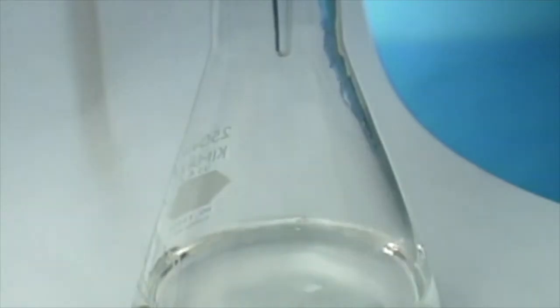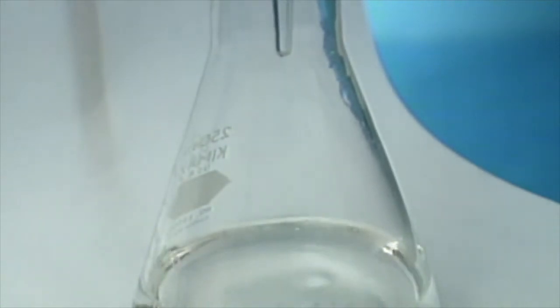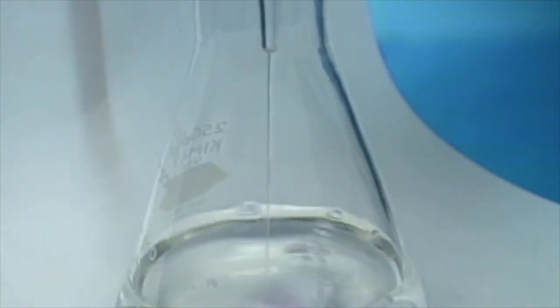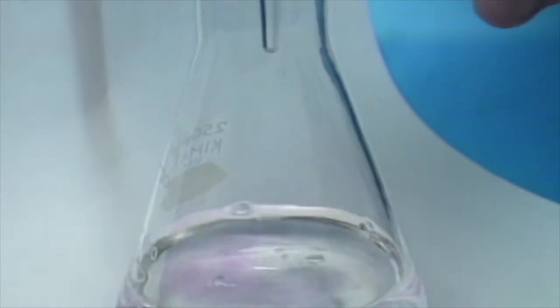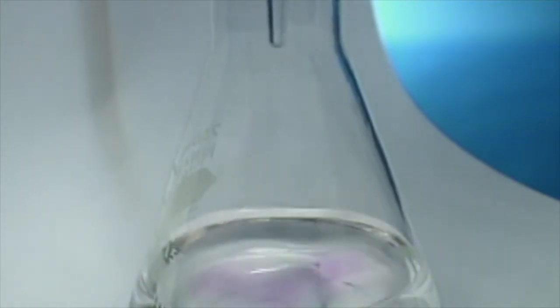If the titrant is flowing full speed when you approach the endpoint, you are almost sure to overshoot. One technique for approaching the endpoint is to deliver short squirts of titrant and watch how they affect the color. At the endpoint, a faint color will persist in the solution.